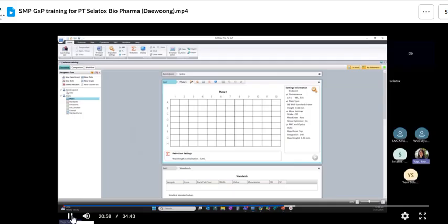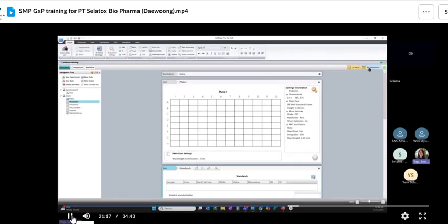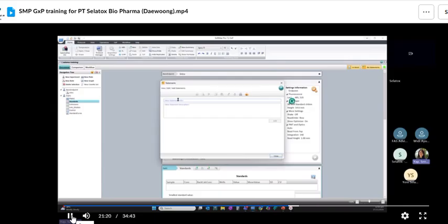So in order to have my file approved in this way, you as a scientist role need to set up the workflow. I will set up this: scientist creates a file, followed by the lab manager approving it, followed by the lab technician running the experiment and the lab manager approving it. So I'm going to create a total of 4 statements. First is protocol develop.